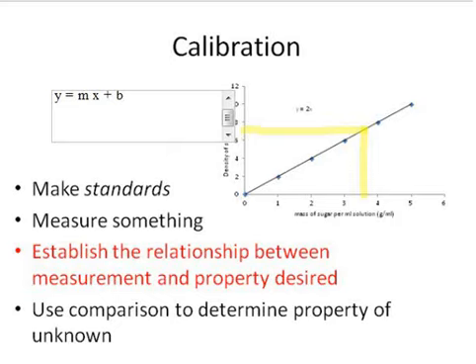So what we've done is we've used a measured property and a known relationship to extract the piece of information that we desired, which in this case was the mass of sugar per milliliter of solution of Coke. And then we can scale up from mass per milliliter to mass per can of Coke, which is a pretty straightforward thing to do. The mass of sugar in a can of Coke is actually given on the label, so you should be able to compare the results that you get to the results that are given on the nutritional information on the can.